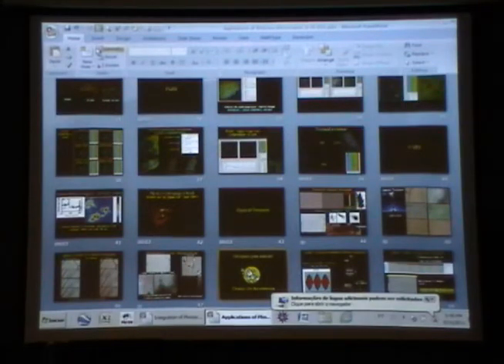Although, with the system that I showed you, wherever place you are scanning here, you're going to be at the same spot size at the entrance of your monochromator. So you could do this scanning, but then you're going to take the spectrum of everything. So if you have a contrast for just what you want to see, it's going to be great. If it's a crawling movement of cells on the bottom part of your cover slip, then it's slow enough that you do not have much problem.